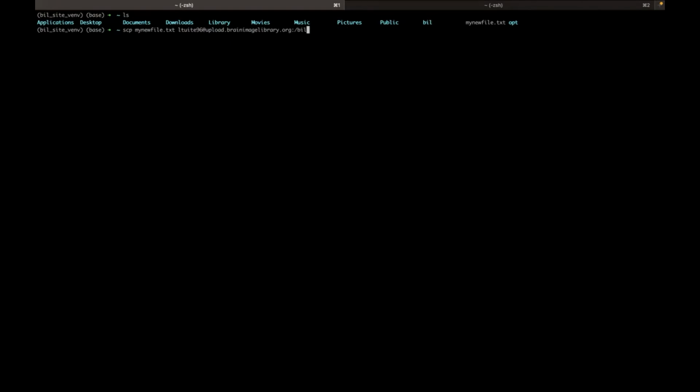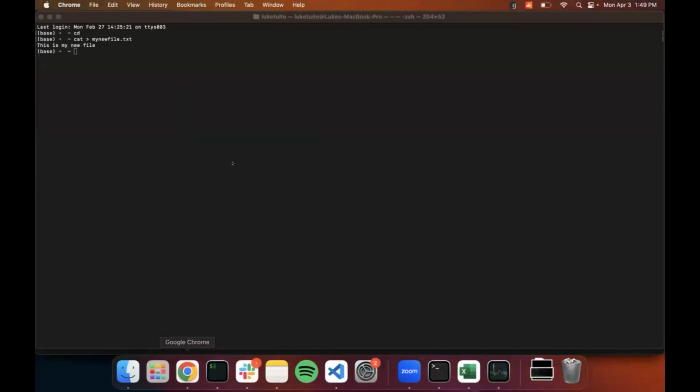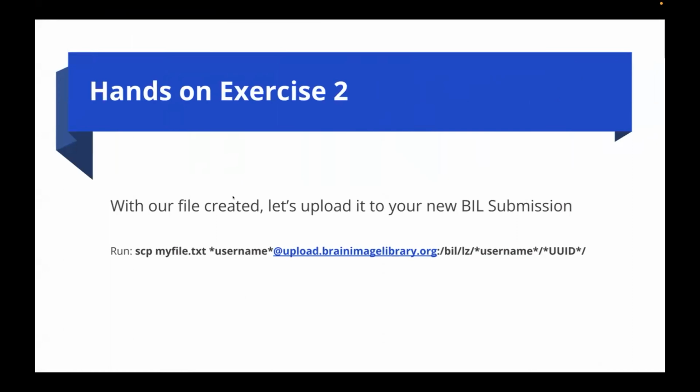Mine is under bil/lz/my username. And then I'm going to jump back and see what my unique identifier was for that.